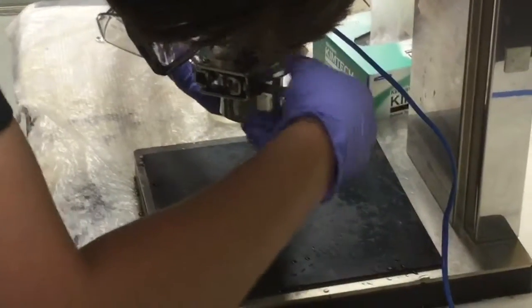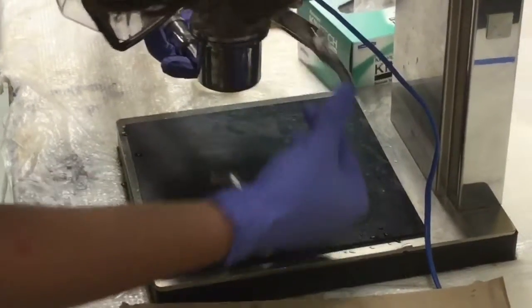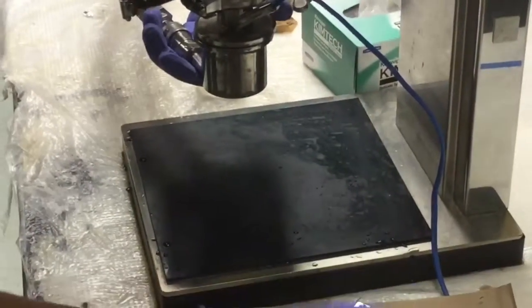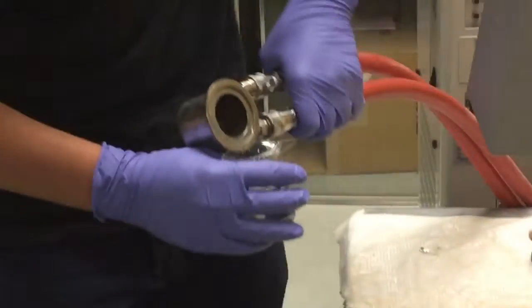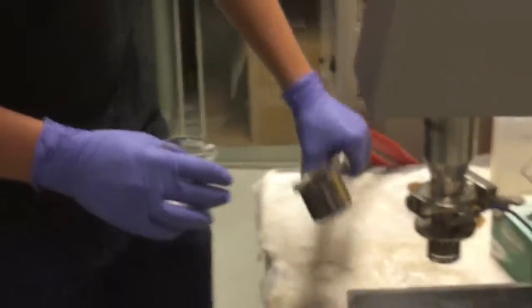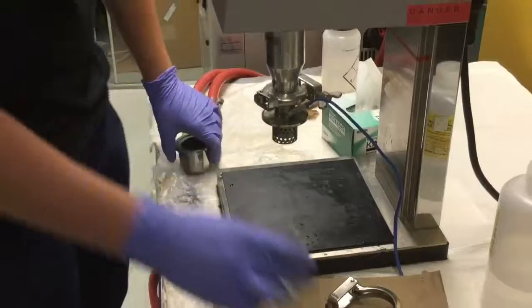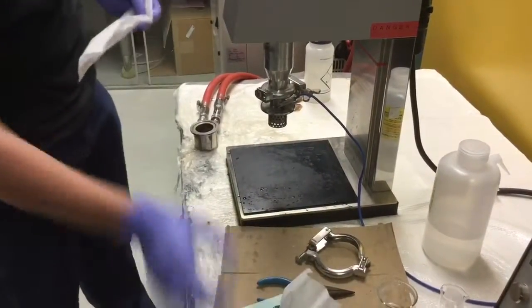Remove the clamp and empty the container into a waste beaker. Wipe the container and the blades dry with Kim wipes.